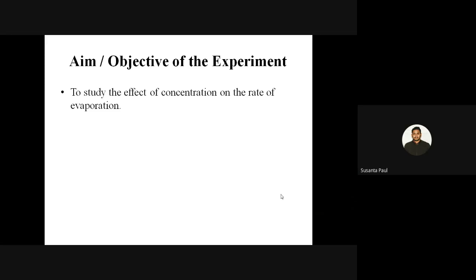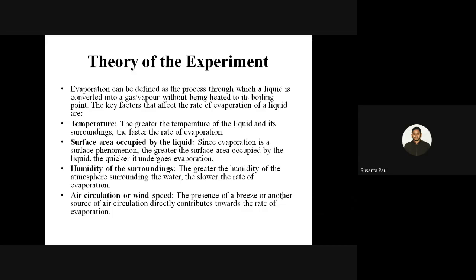At first we have to know what evaporation is. Evaporation can be defined as a process by which liquid water goes directly into its vaporization state due to an increase in temperature. It is very obvious that if we increase the temperature, we will get a higher rate of evaporation. Now, the equipment that can be used for evaporation purposes, we can call them evaporators.